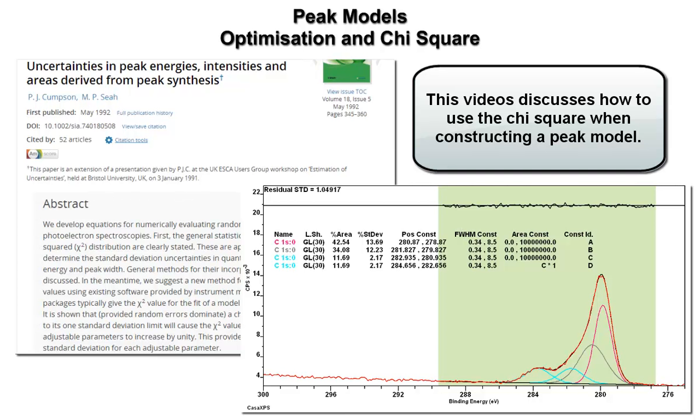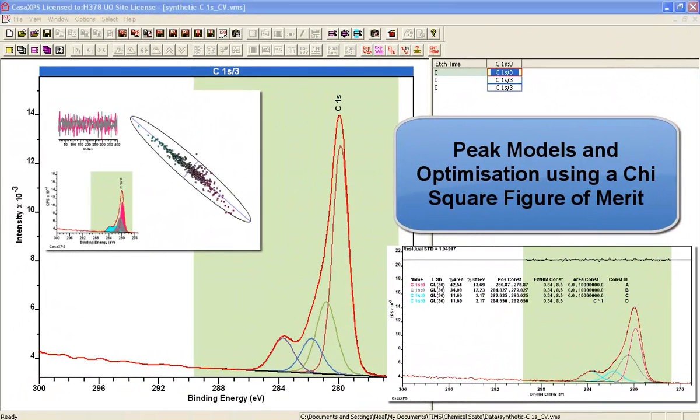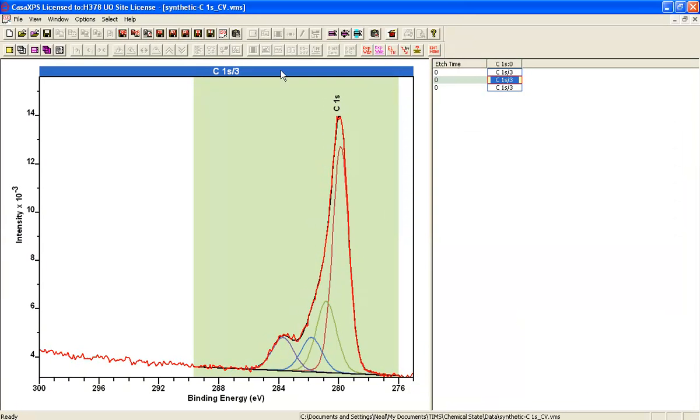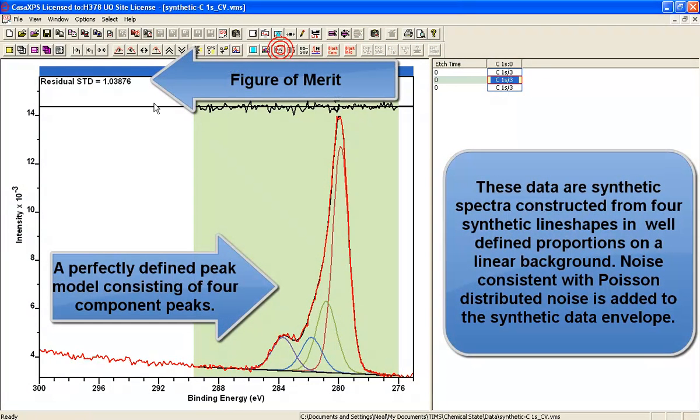We're going to investigate in this video how the chi-square influences a peak model. We're going to do this using a set of synthetic data that has been created from a set of four component peaks and a linear background.